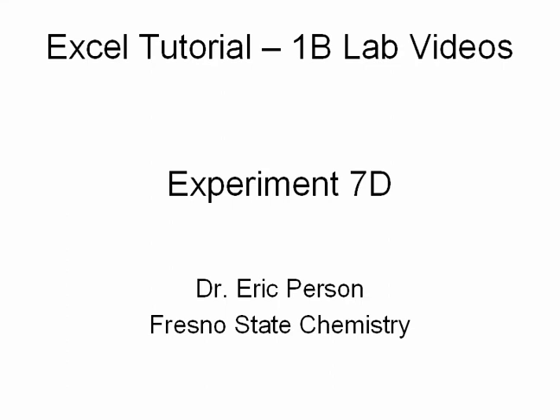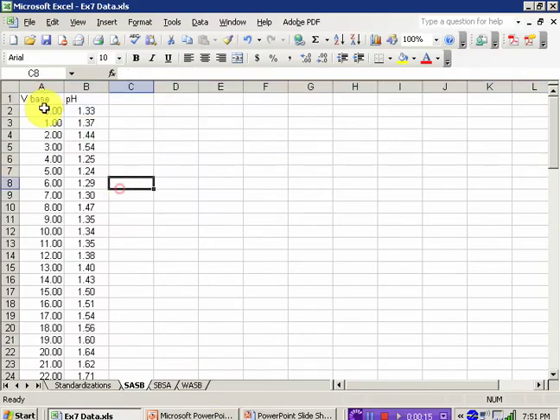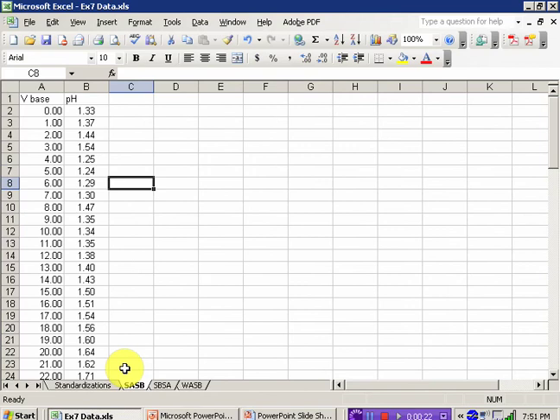Hello, in this Excel tutorial video for Chem 1B, we'll be looking at the next part of the data workup for Experiment 7. If you recall, last time we had done some standardization titrations and done those calculations. If you did those by hand, you're going to be able to enter them in manually here, or we'll refer back to that sheet. I'm on a second tab.